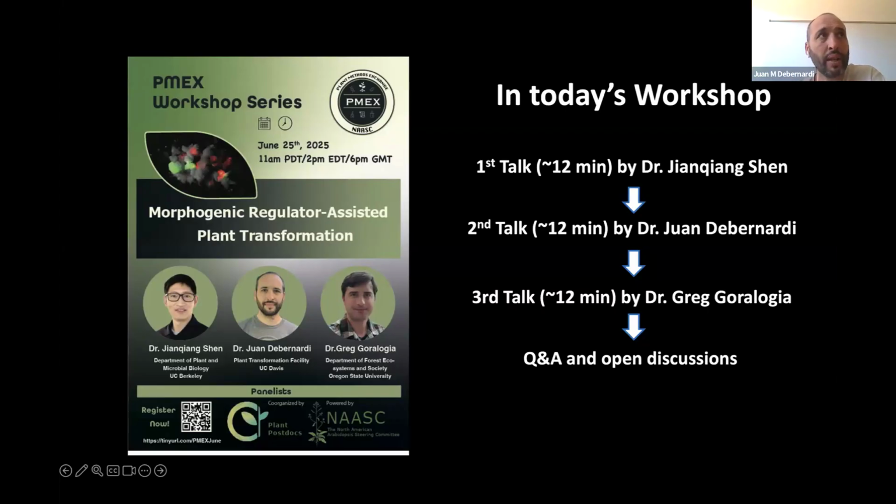But what I said about DEX being toxic, we found, for example, that tomato doesn't like DEX. At least you have to use a very low concentration, which could be a problem when you have to induce. I was asking the tomato community because DEX is a very useful system in Arabidopsis, and I was wondering how people in tomato are doing DEX inducible approaches, but I couldn't get a good answer on that. But we do see some reduction in shoot induction when we add DEX into the plates in tomato.